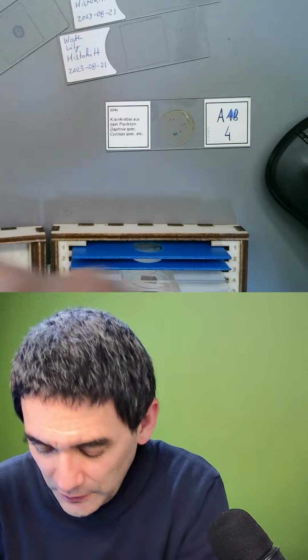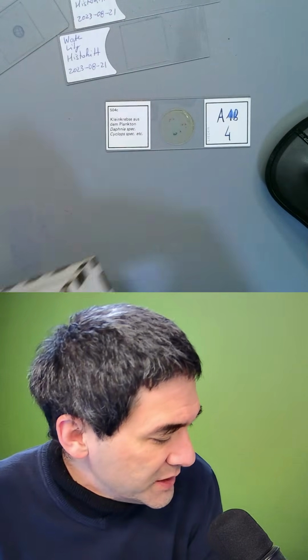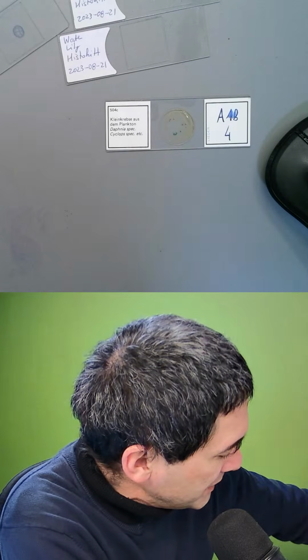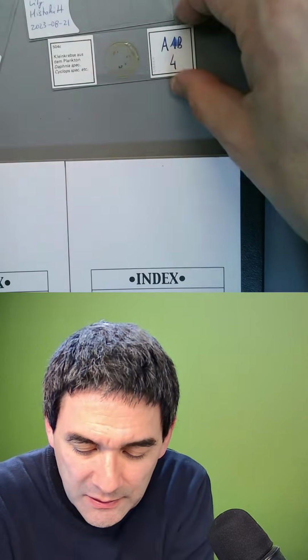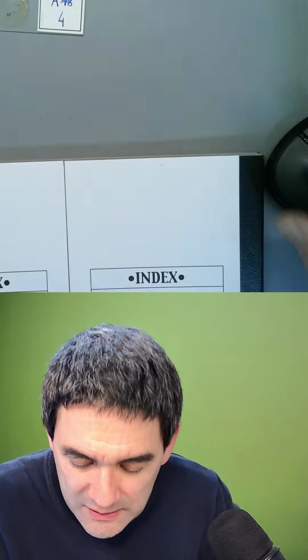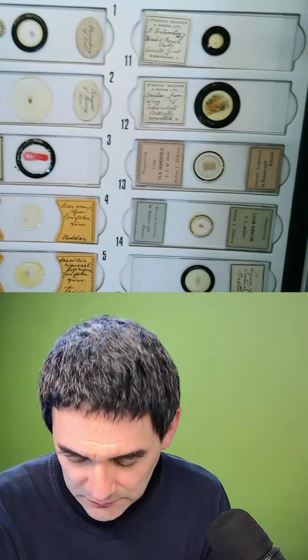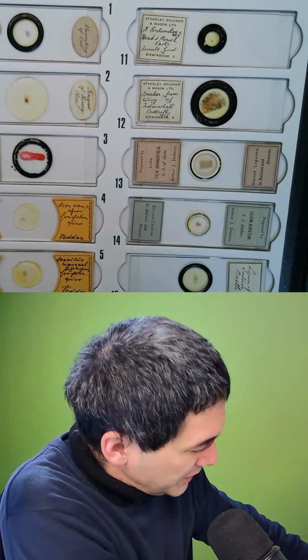So let's do the following. I want to show you some of the slides that I bought. I've already made videos about some of those before, but they are really nice. Let me put all of the other slides away. Look at this, what I got here. These are some antique slides that I bought, and let me see where the other one is.